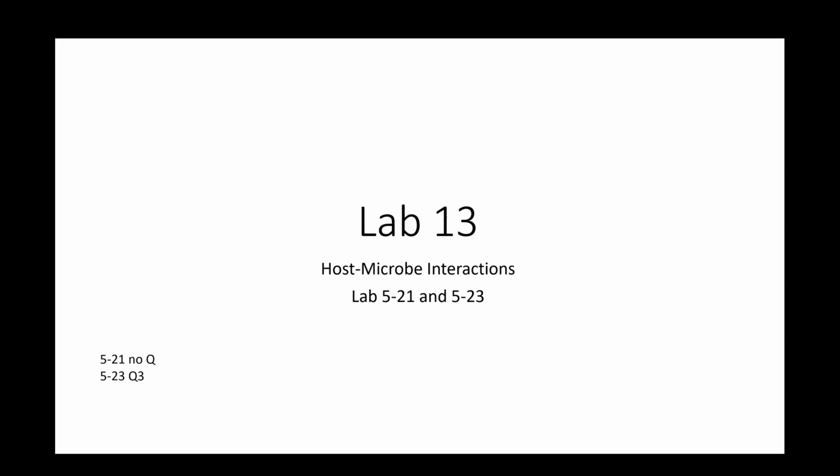And this lab is going to focus on two labs that exemplify the relationship that some of these pathogenic microbes have with the host, specifically us in a human host. So this lab focuses on lab 521, which is the blood hemolysis lab, and 523, which is the coagulase lab.